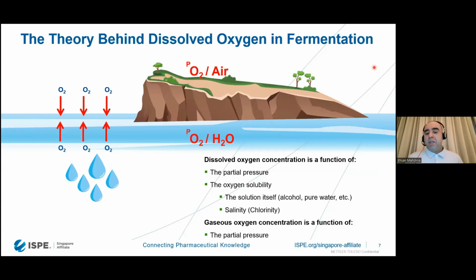So the solubility of oxygen essentially depends on a few more parameters as well. Salinity or chlorinity of the aqueous solution is one parameter. The more salts you have in the solution, the less solubility of oxygen you have at hand.